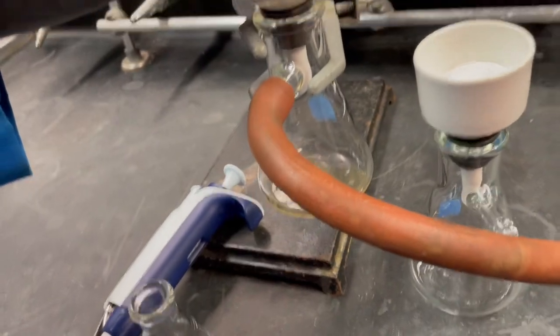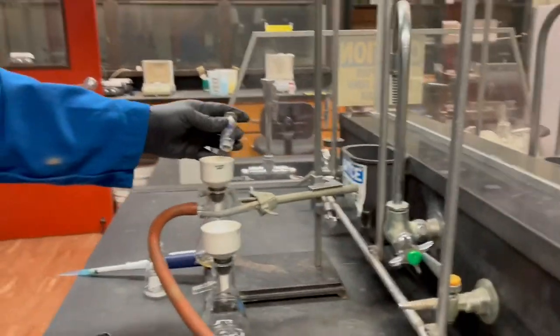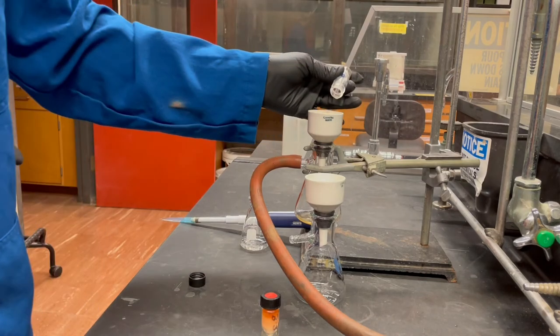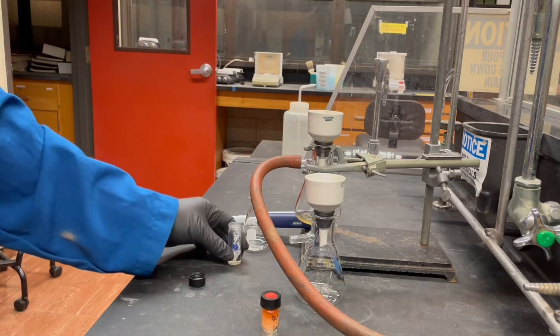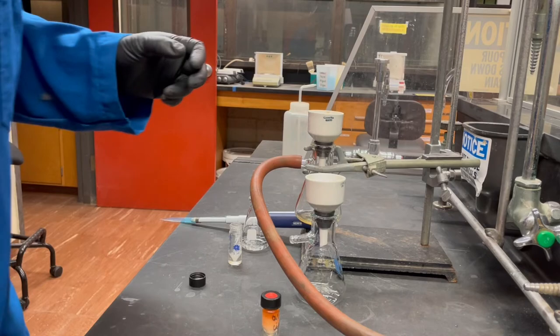This stuff down here is actually going to contain the other isomer, and we might want to analyze that via TLC. So I'm going to save that. Unfortunately, it does react with the light, and it will isomerize from the cis,trans isomer to the trans,trans isomer. It might not survive overnight, which I'm going to end up having to do. It is what it is though, right? Gotta do what you gotta do.